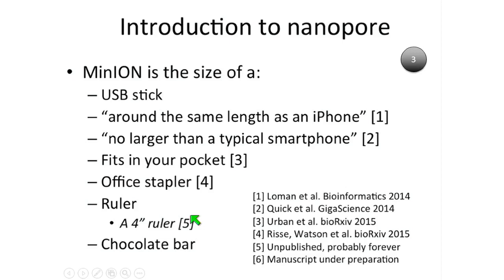So I just want to clear up something about the nanopore for everyone, which is essentially, how big is it? There's a lot of confusion in the literature, and I guess we as prolific nanopore authors have added to that confusion by posting various things in manuscripts. Very early on, we said in a manuscript in Bioinformatics, one of the first MinION papers, that the MinION was about the same length as an iPhone. And at the time, that seemed very reasonable. It was an iPhone 4 I had at the time.